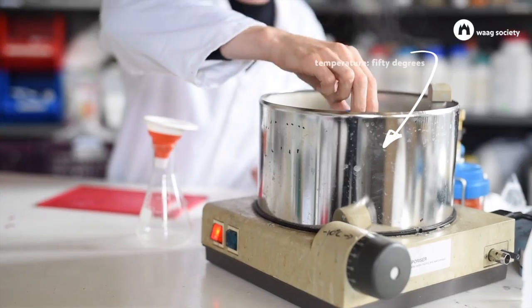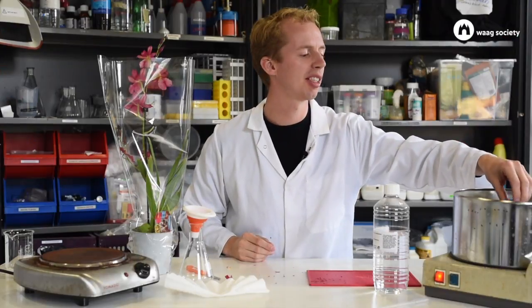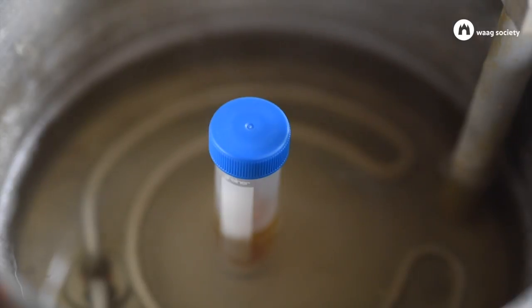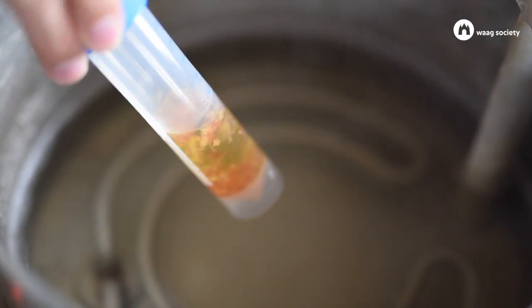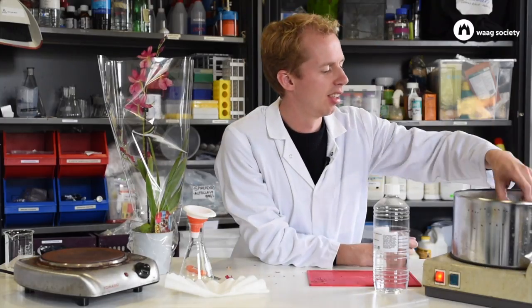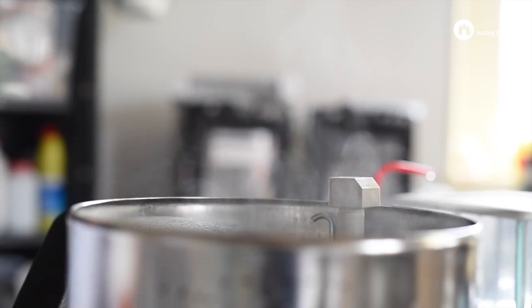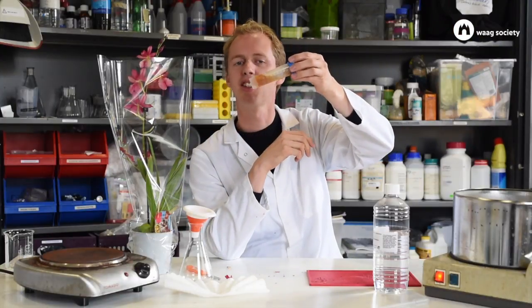You can also place the tube in a water bath for two hours to really do the extraction well. The tube has been in the water for a couple of hours and now you can see that the liquid has changed color.